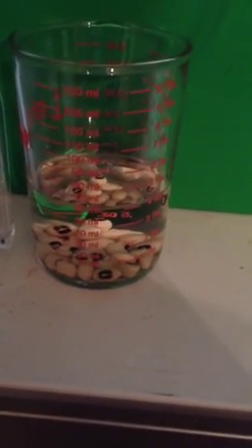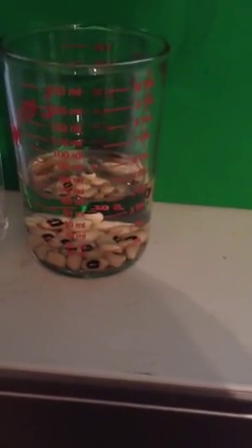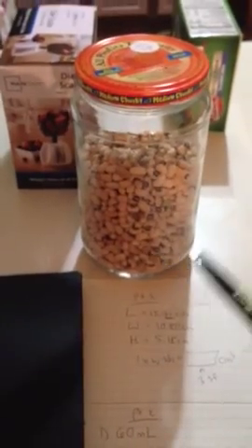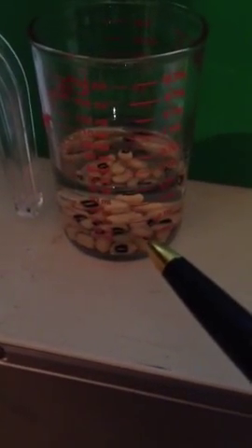And I would also like to add in to be sure to repeat this experiment 3 times. I did it once, for example, but make sure that you take 3 separate samples of dry, whatever it is you choose, weigh it, and then put it into water to notice the water displacement and the volume, and then throw this sample out, get a fresh sample, weigh it again, and then find the volume, because you're going to use those 3 pieces of information, those 3 densities, to average together and conclude what the density of that food is.